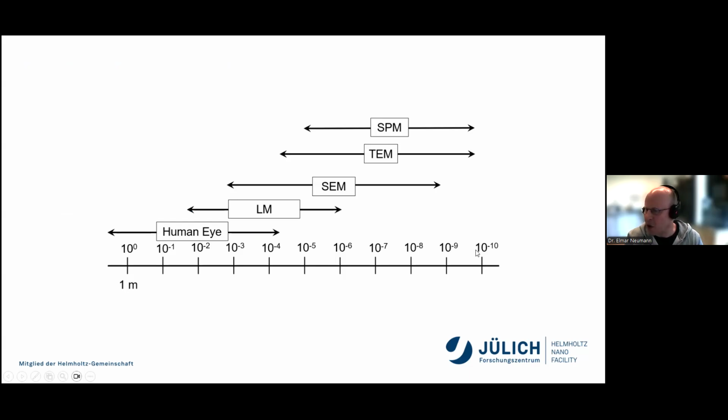Okay, here is again a comparison between the different methods, from 1 meter to the nanometer range, and here you can see the different and overlapping areas where you can use the different methods in this case.